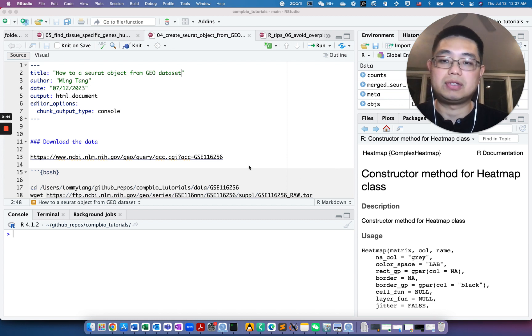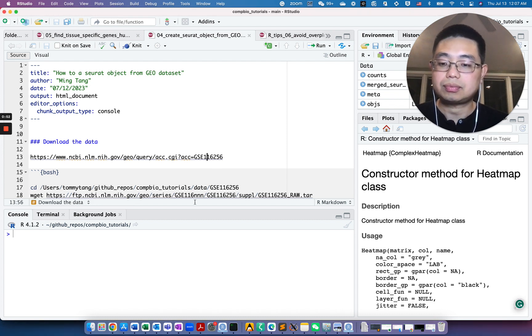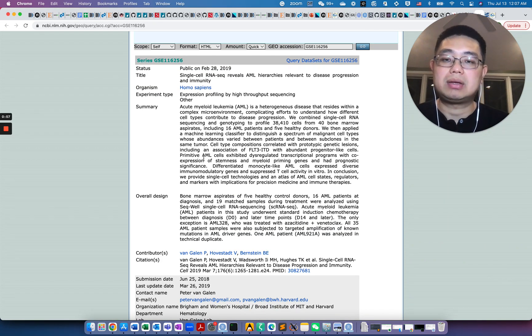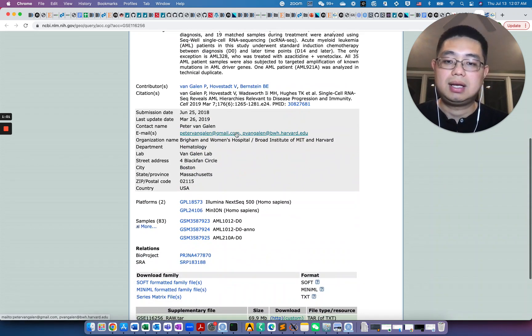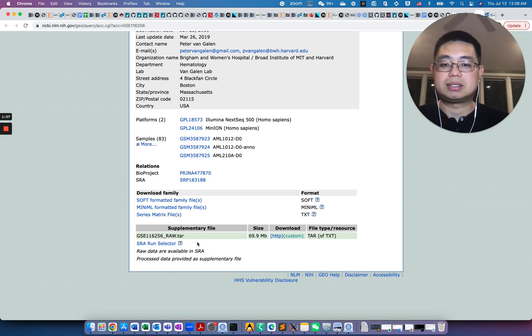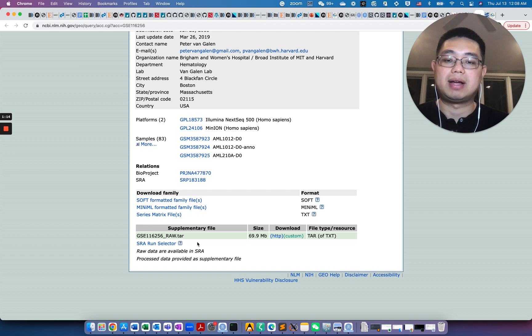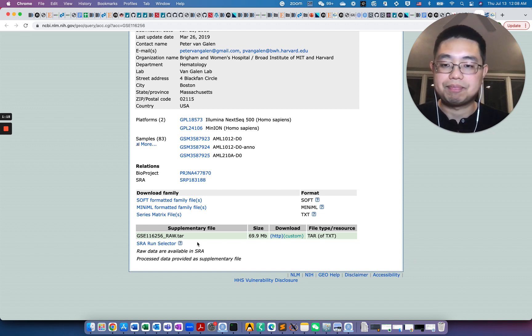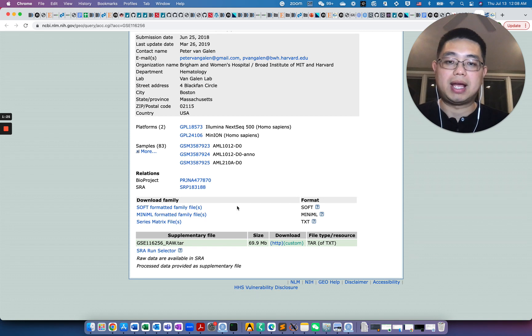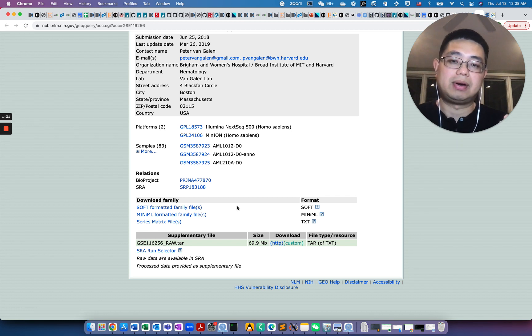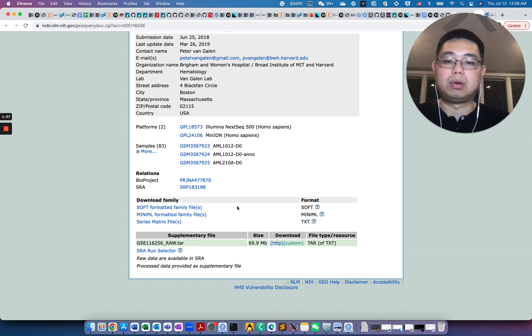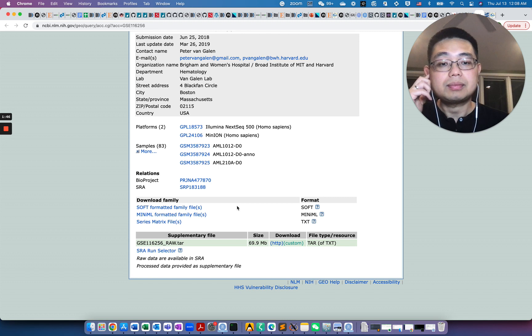Seurat actually has a really comprehensive tutorial for downstream analysis. Once you create a Seurat object from those GEO datasets, you can easily make many visualizations. Today for demonstration, we're going to use this dataset, this GSE accession number. This is an AML acute myeloid leukemia single cell RNA sequencing dataset and it has actually 43 different samples. We will download all the data matrices, count matrices and annotation metadata files, create a Seurat object for each of the files and merge them into a single big Seurat object.